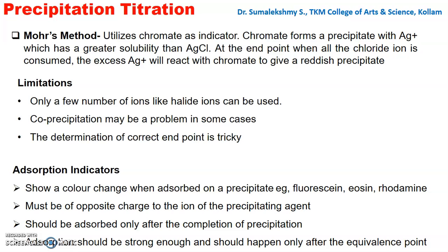Then the last point is the adsorption should be strong and should happen only after the equivalence point.